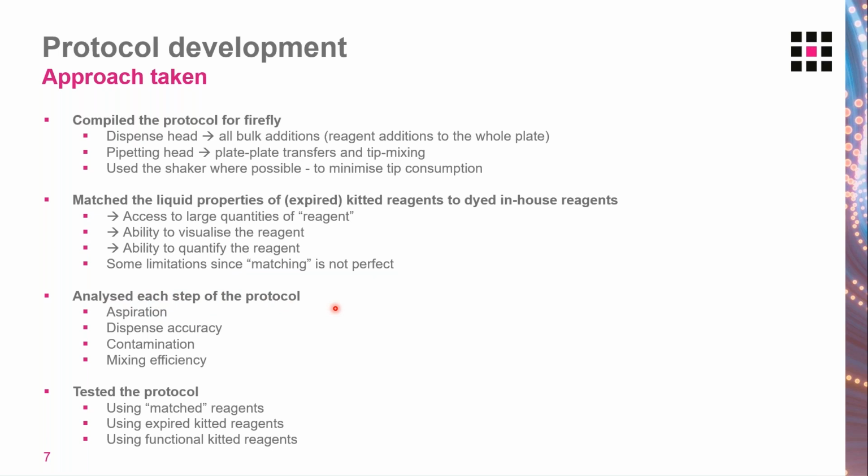detail. We look at each aspiration, we look at the aspiration speed, whether it's suitable, is there air being aspirated, and we look at each dispense. We are looking to achieve clean tips after a dispense. We're lucky in that the tips we use for Firefly are all transparent, so you can really see what's going on inside the tip, and we can make sure that our dispenses are executing how we want them to.